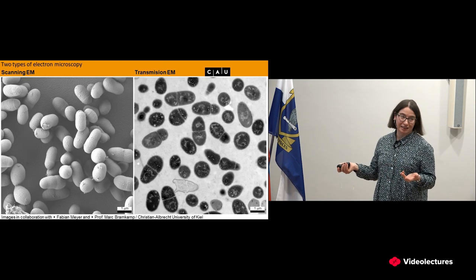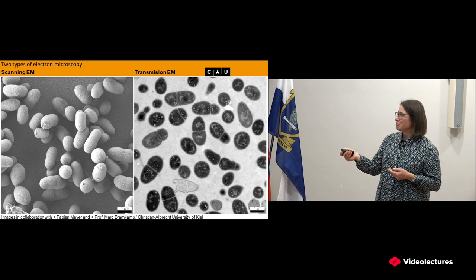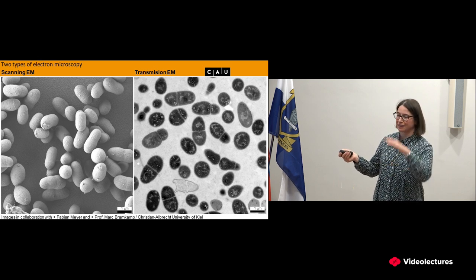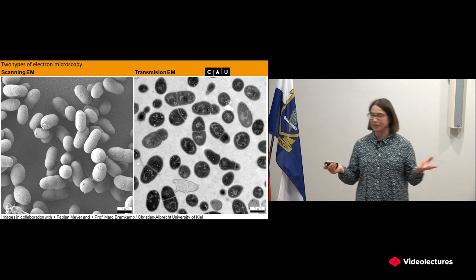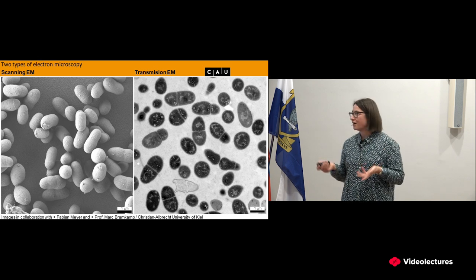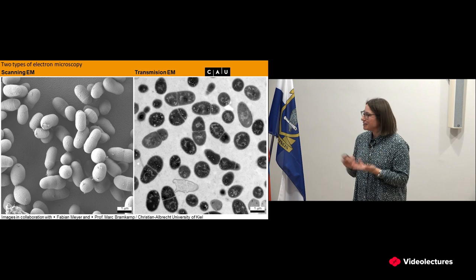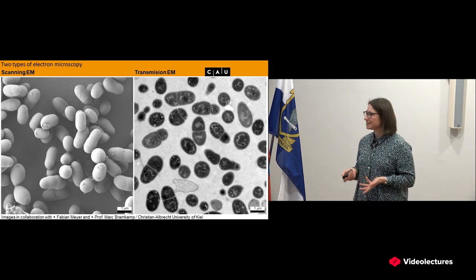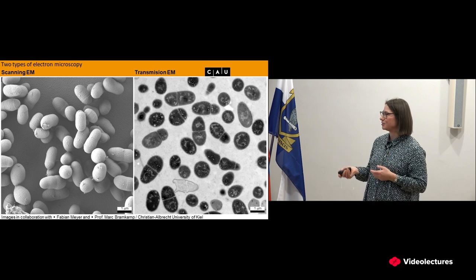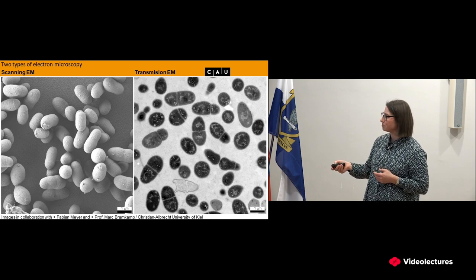Something like here. And I can tell you I had a bizarre experience. I was showing in one talk circular profiles and the envelope, the structure. And in the break, people came to me and said, oh, we didn't know Bacteroides is a coccus, is a sphere. And I said, no, no, it is a rod. And I realized that I have to emphasize this, because if you're not trained to do this, you would easily think, oh, how many diverse bacteria you have here.